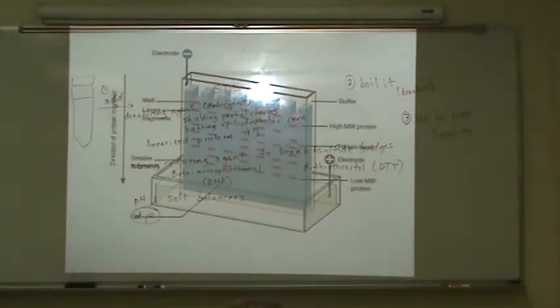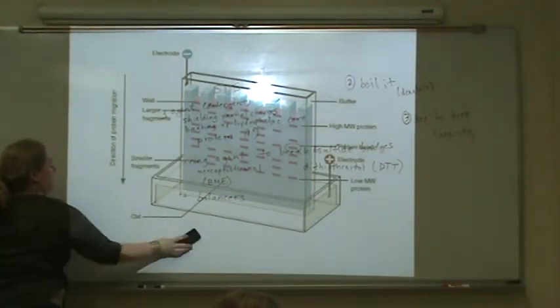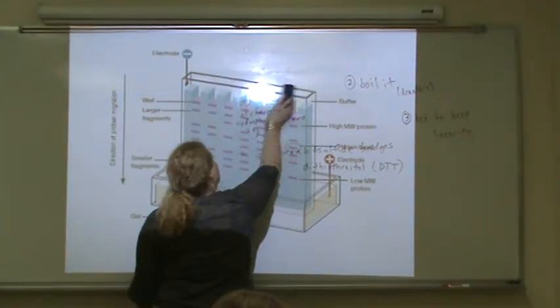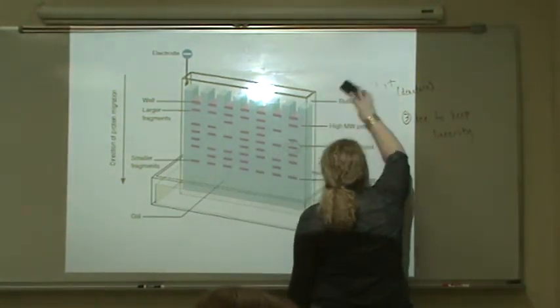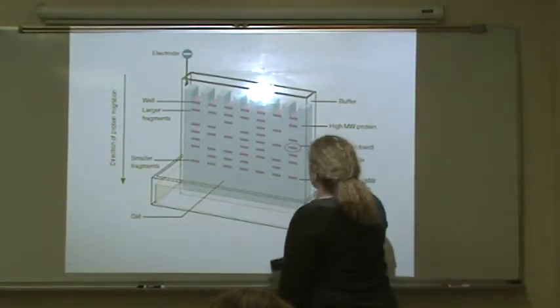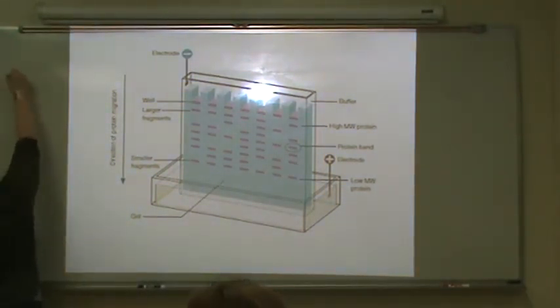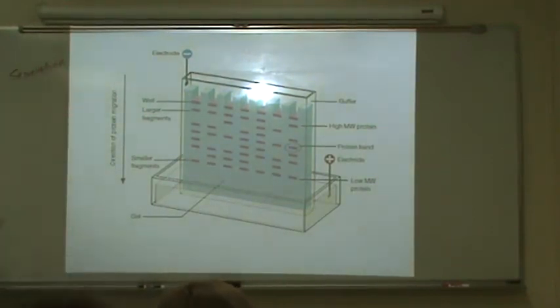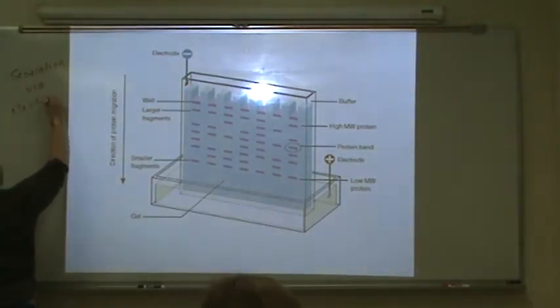Somewhat depends. So after you have prepared your sample, you've got linearized proteins, they're all mixed up in tubes together. You will normally determine the weight of your protein by running it through a gel matrix. And so this step would be called separation. You're separating proteins by size, and in this type of method, we're particularly doing that by electrophoresis.